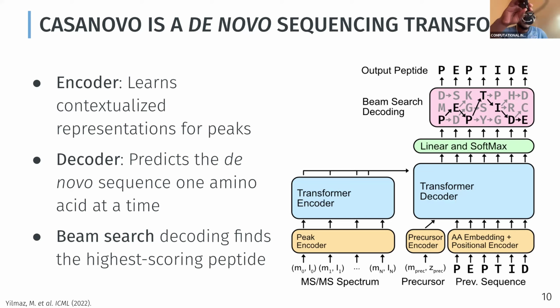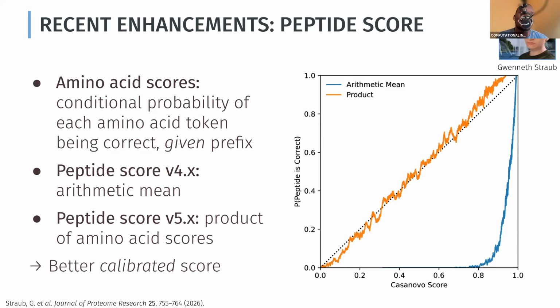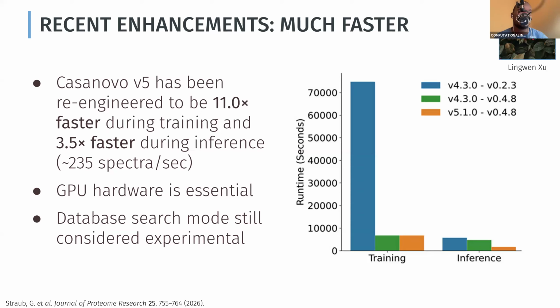Okay, that's great. Thank you. I think my next question somehow interlinks to beam search. But fundamentally, it is about the performance improvement you talked about of 11 point something, which is really overwhelming. And for me, I want to know the engineering fit there, whether the speeding up actually comes from data loading, or the GPU compute, or the beam search itself?